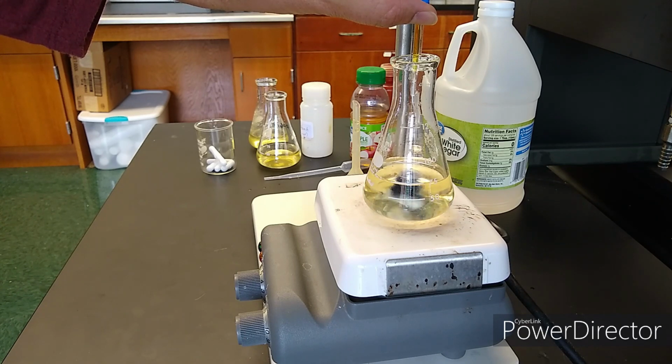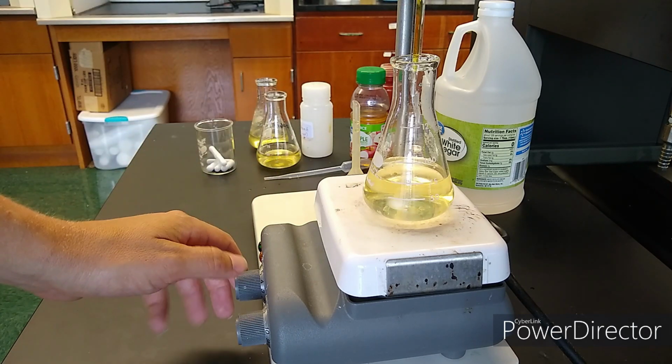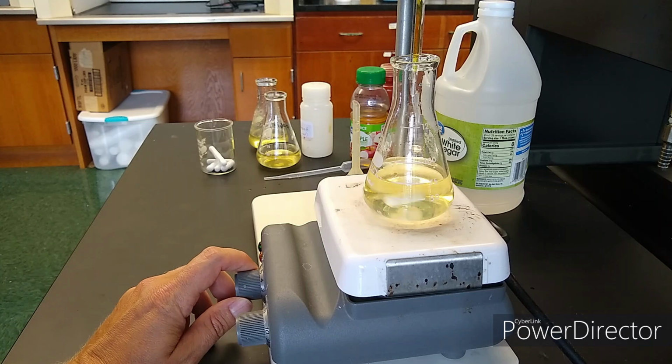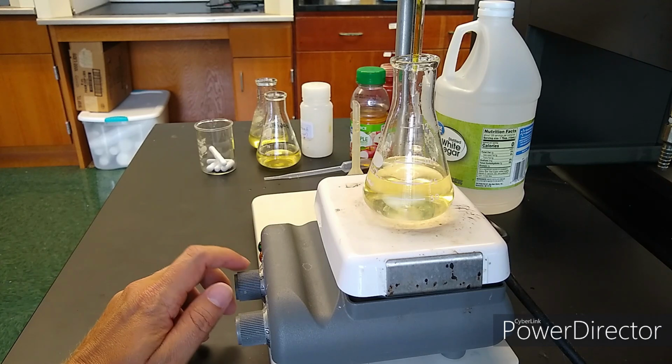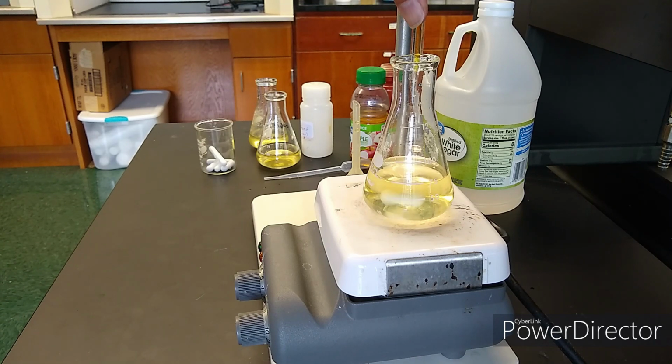But as soon as it gets out of that spot and the ascorbic acid has time to hit it, then it will disappear. Now the advantage of the auto stirrer is that we can speed it up, and that will help that black color to disappear very rapidly, even when you're close to the end point. As you get closer to the end point, that purple color starts to disappear more and more slowly. And rapid stirring, though, of course causes it to come in contact with more ascorbic acid, and it will still disappear as long as there's ascorbic acid left in the solution to react with it. But it's starting to disappear more slowly as we get close to the end point.